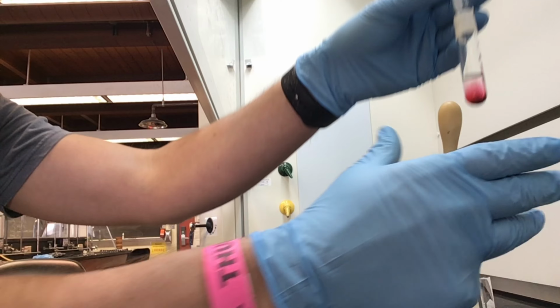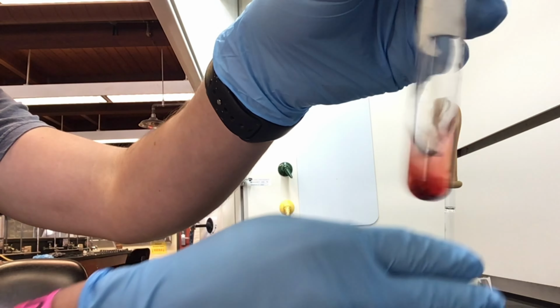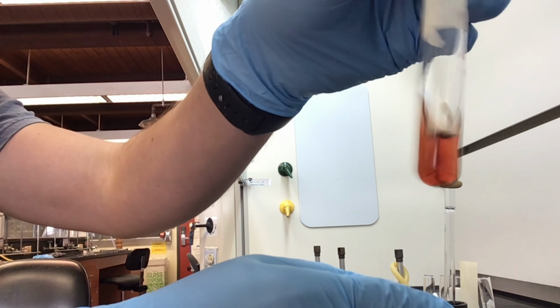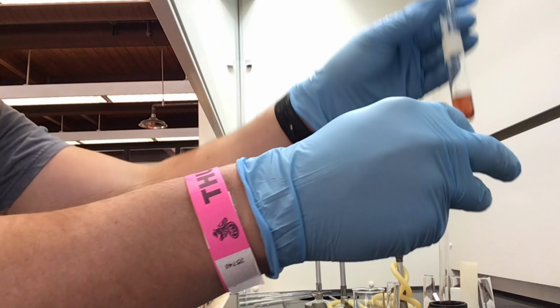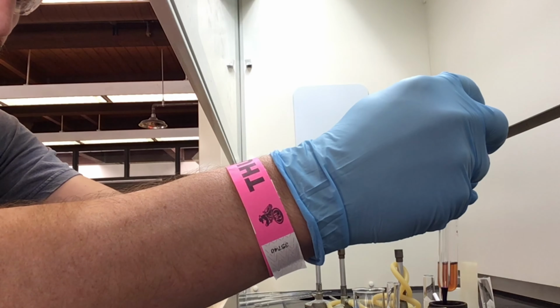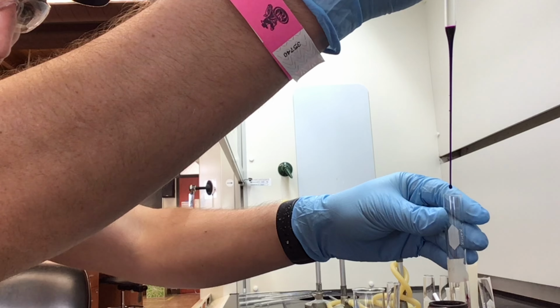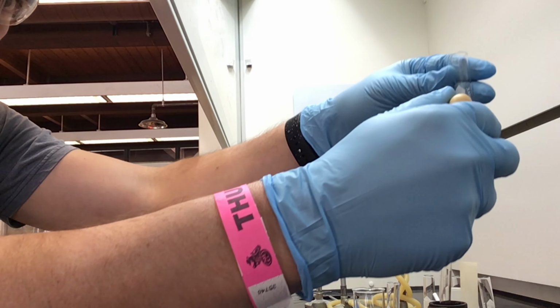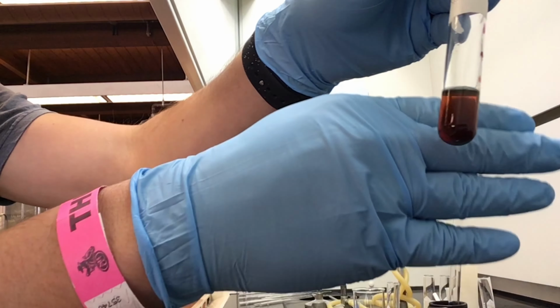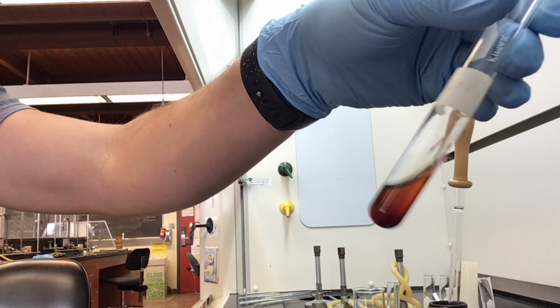I'm taking a look at it. It looks pretty cool, I must say. Give it a little shake, mix it up. That purple, it's not that vibrant purple anymore. You can't really see an obvious precipitate or anything, but there's definitely a color change, right? From that gorgeous purple. There you go. I added a couple more drops just to see if we see any significant or obvious change. But there you go.